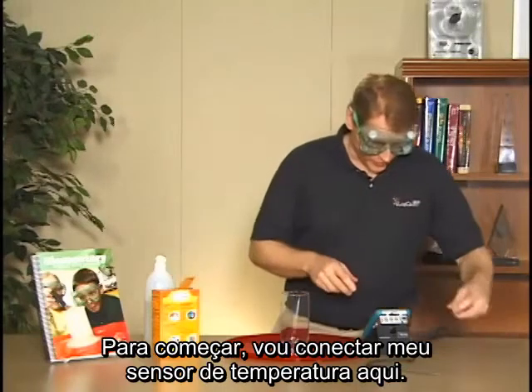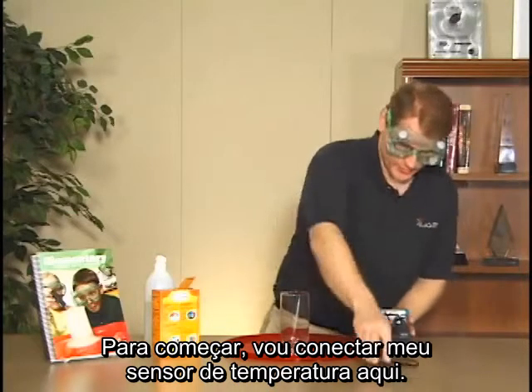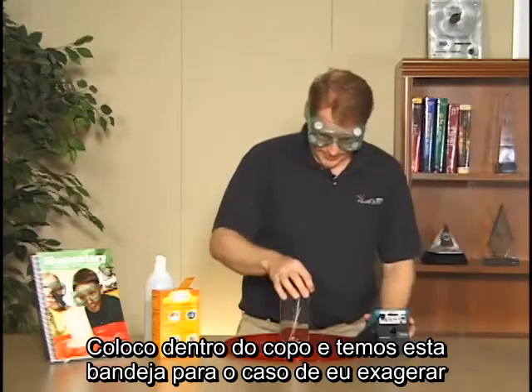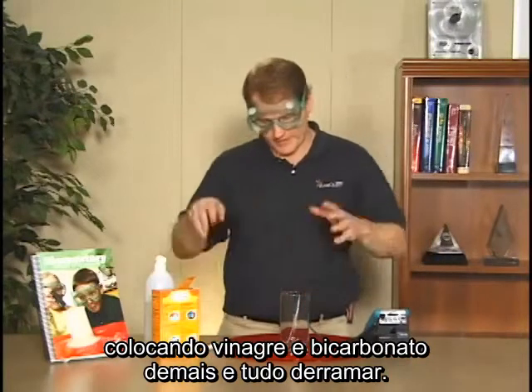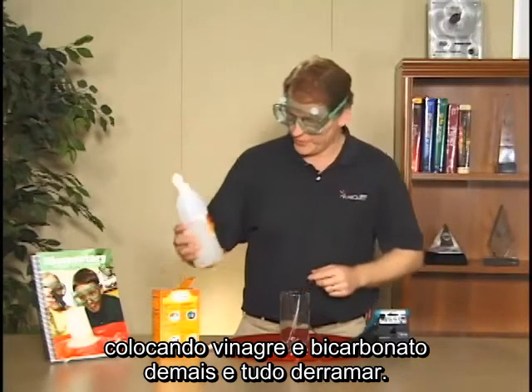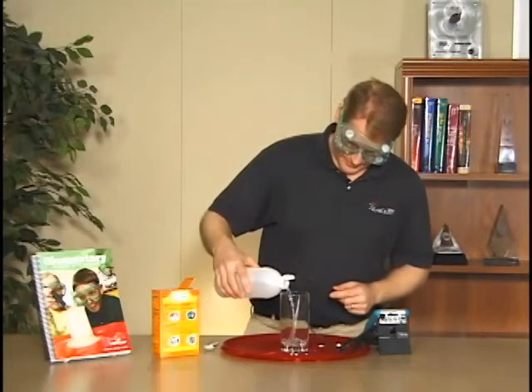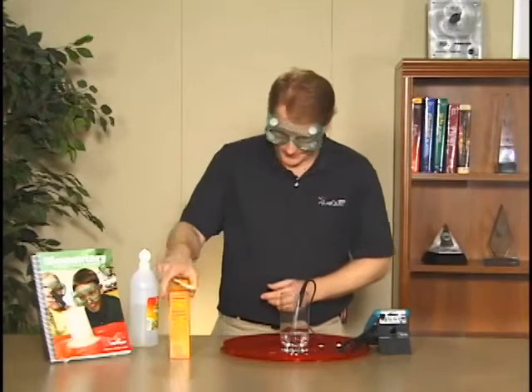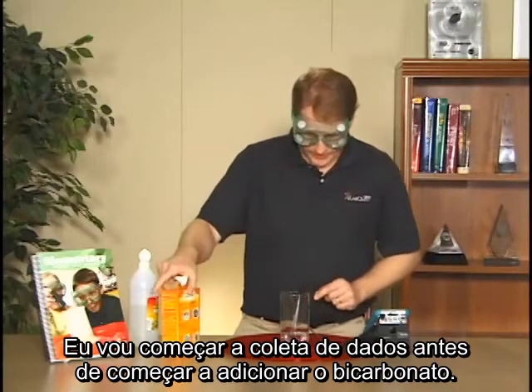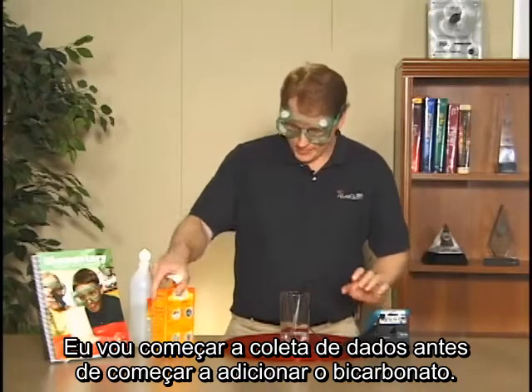To start off, I will just plug in my temperature sensor there, put it down into my glass there. And we have this tray here in case I get excited and make everything go all over the place with too much vinegar and baking soda. So I'm going to put some in there. The book kind of specifies how much to use, but that looks pretty good. And what I'm going to do is start the data collection first before we add the baking soda.